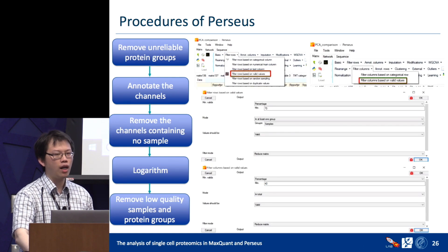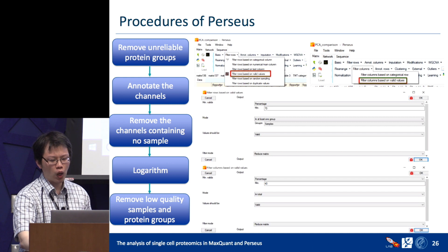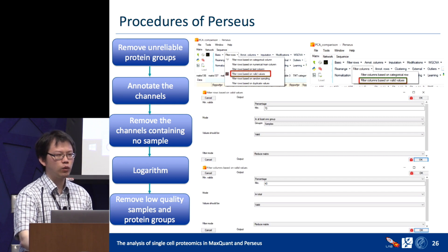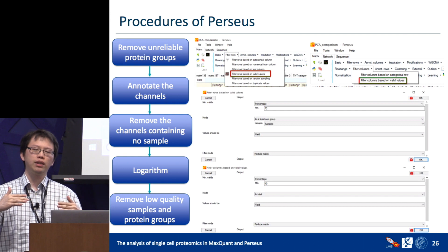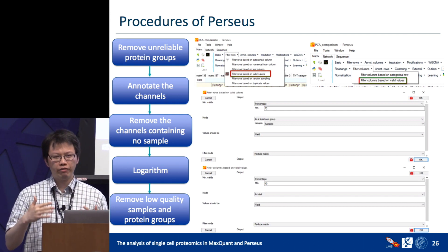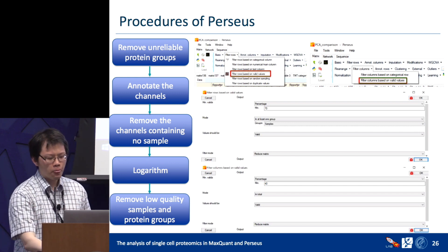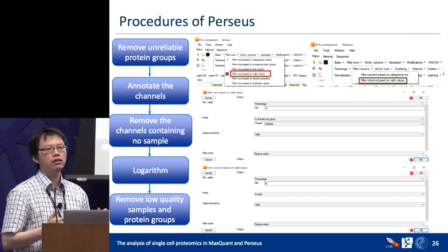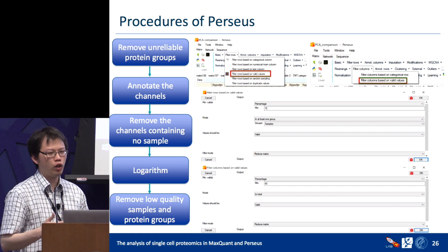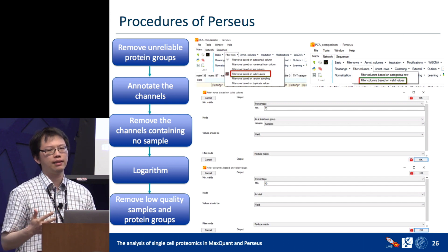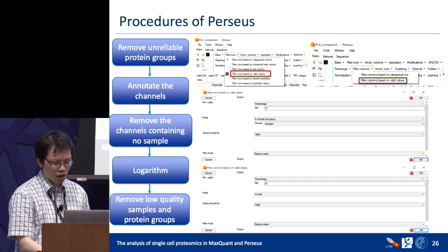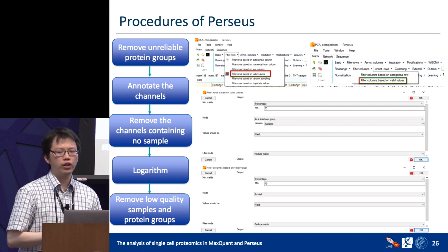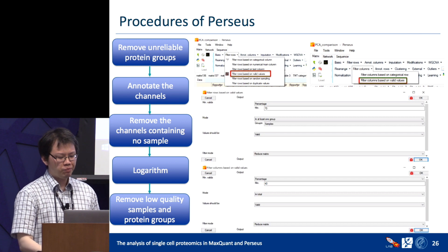After log transformation, we can remove low-quality samples or protein groups using Filter Rows and Filter Columns. Filter rows by valid values using a percentage cutoff — we use 70%, meaning protein groups with more than 70% valid values are kept. You can set the condition to require at least one group or all groups to pass this cutoff. For columns, we use a 40% cutoff. This gives us a high-quality table.